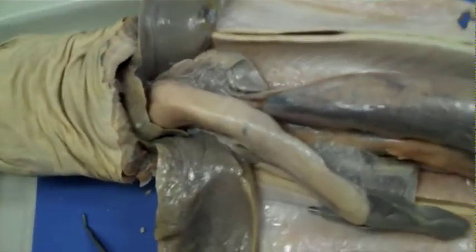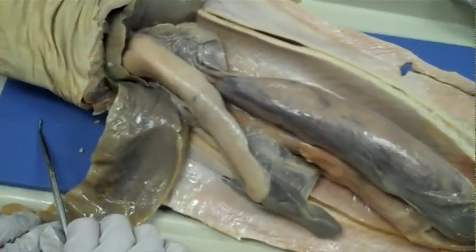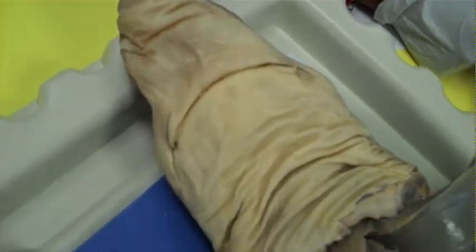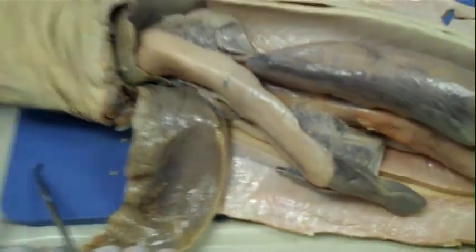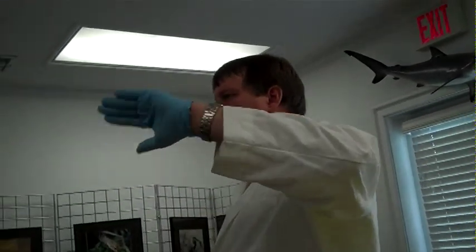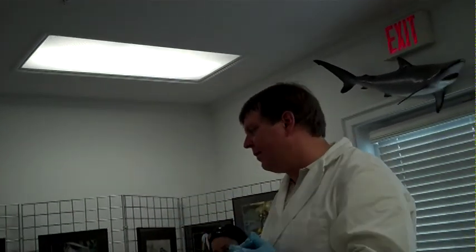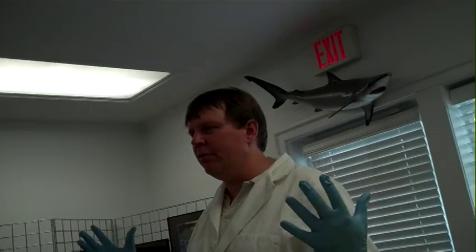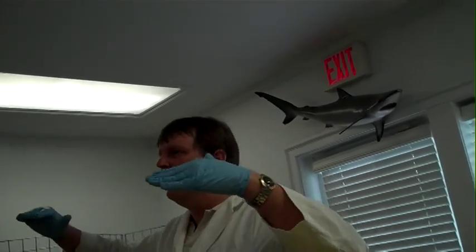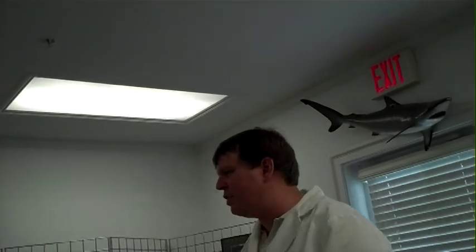The next thing that could have something interesting in it is the digestive system. The digestive system starts off at the mouth. Up behind where the heart is, there's going to be an esophagus which will lead into the stomach. If you open up your stomach and it is not full, what you will see is rugae — the rugae are the ridges inside the stomach. If your stomach is full, no rugae, because it's been expanded and the rugae has been flattened. The rugae are designed to increase the surface area for digestion.